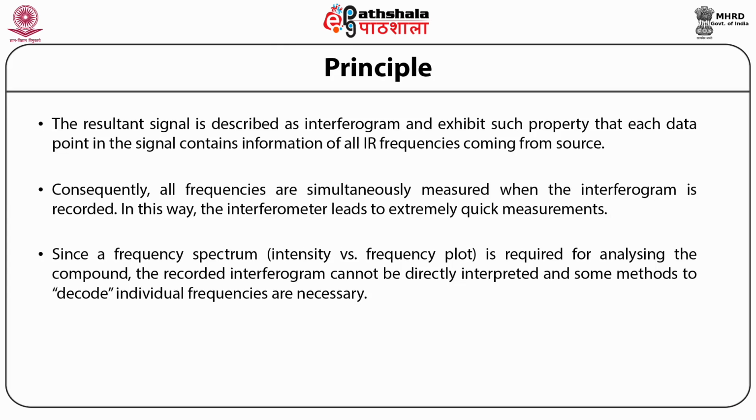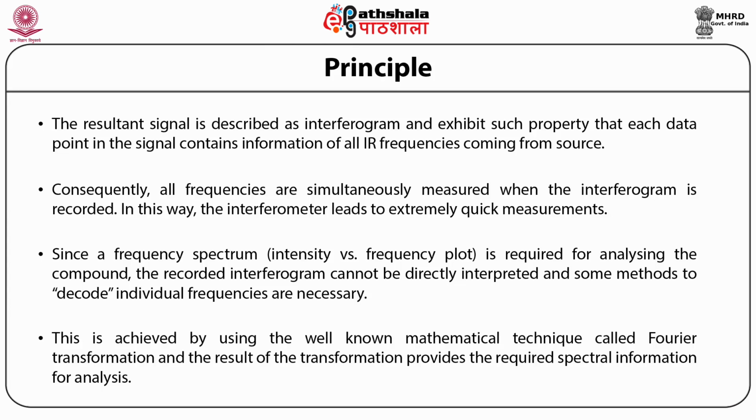Since a frequency spectrum, that is, intensity versus frequency plot, is required for analyzing the compound, the recorded interferogram cannot be directly interpreted and some methods to decode individual frequencies are necessary. This is achieved by using the well-known mathematical technique called Fourier transformation, and the result of the transformation provides the required spectral information for analysis.